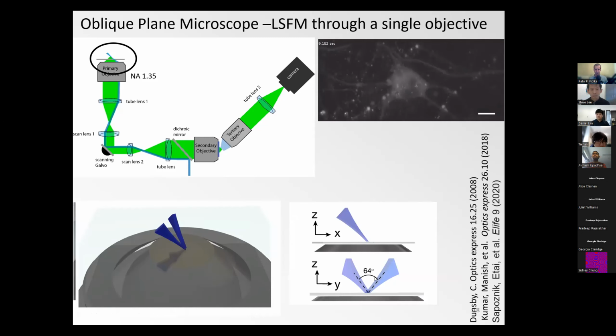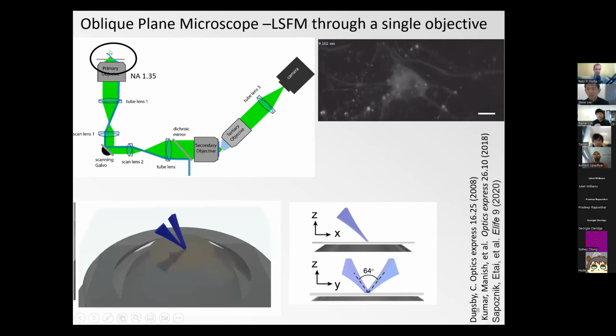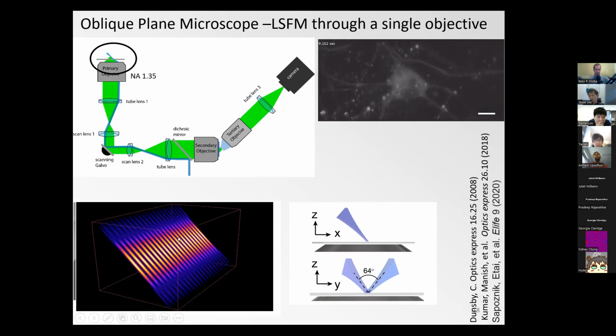And if they're coherent to each other, then at the very area where they overlap, they will form an interference pattern. So this simulation shown here is essentially what would happen if these 2 angled light sheets would interfere with each other. So you can essentially create a light sheet that is structured along its lateral direction. So this is a numerical simulation. If you were to look from the side, it would just look like a normal light sheet. If you look from behind, you would see a fine interference pattern. So this was the realization that with this microscope geometry, the OPM, we could actually realize structured illumination, maybe even produce a finer pattern than we can do with the lattice.